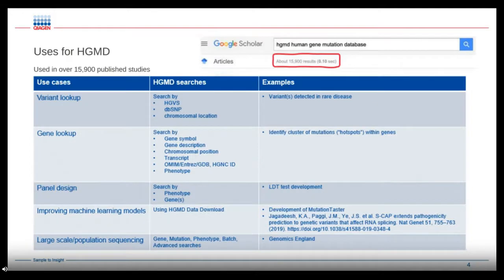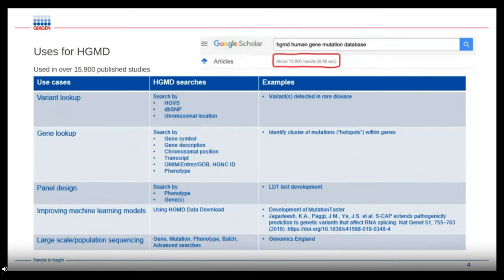There are lots of different uses for HGMD. There's a simple way you can use it: you can have a variant that you're interested in and look it up. You can search by HGVS nomenclature, by a dbSNP identifier, or just by chromosome or location. This will show you whether your variant is in HGMD, and is particularly useful for detecting variants in rare diseases.